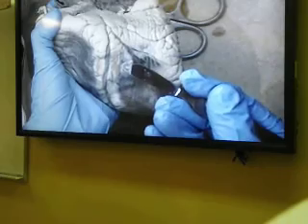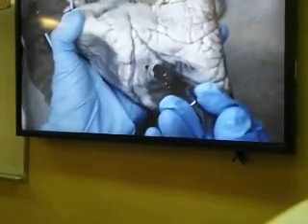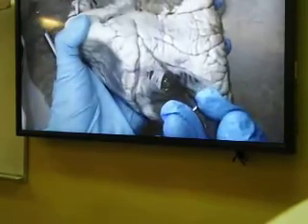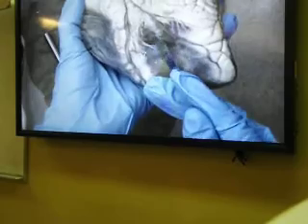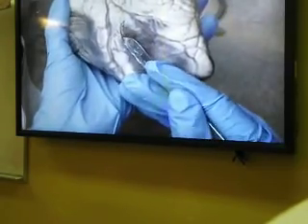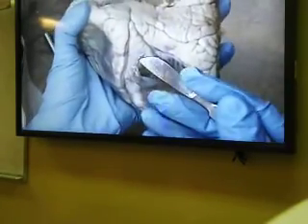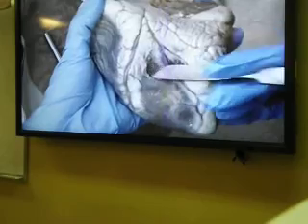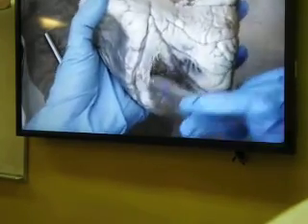So this is the visceral pericardium that you are seeing, and underlying that you also see fat tissue. And this is the real heart muscle right here, myocardium, anterior myocardium, myocardium of the anterior wall. Okay, so it's good to see, but we are not going to separate the visceral pericardium or epicardium.